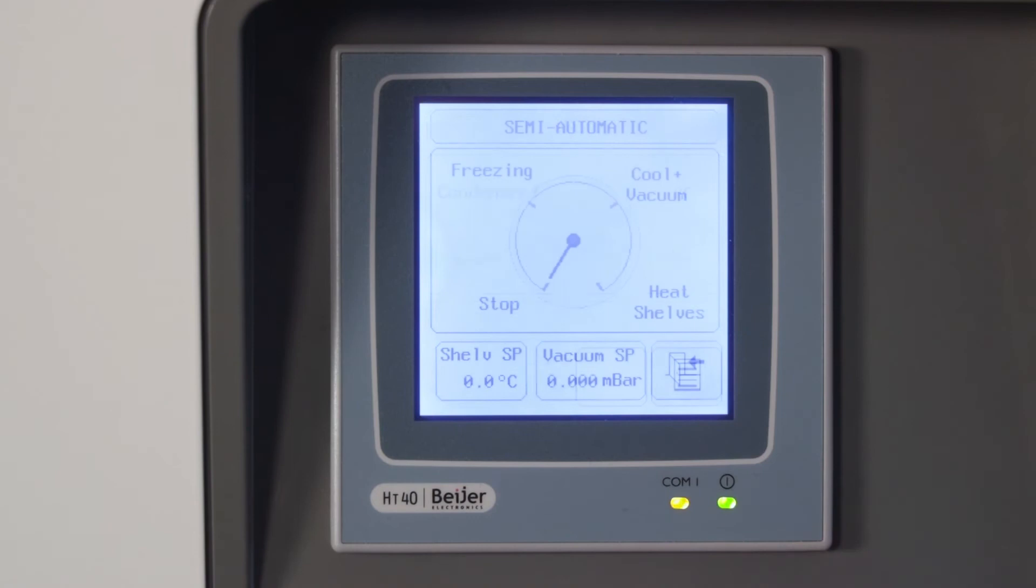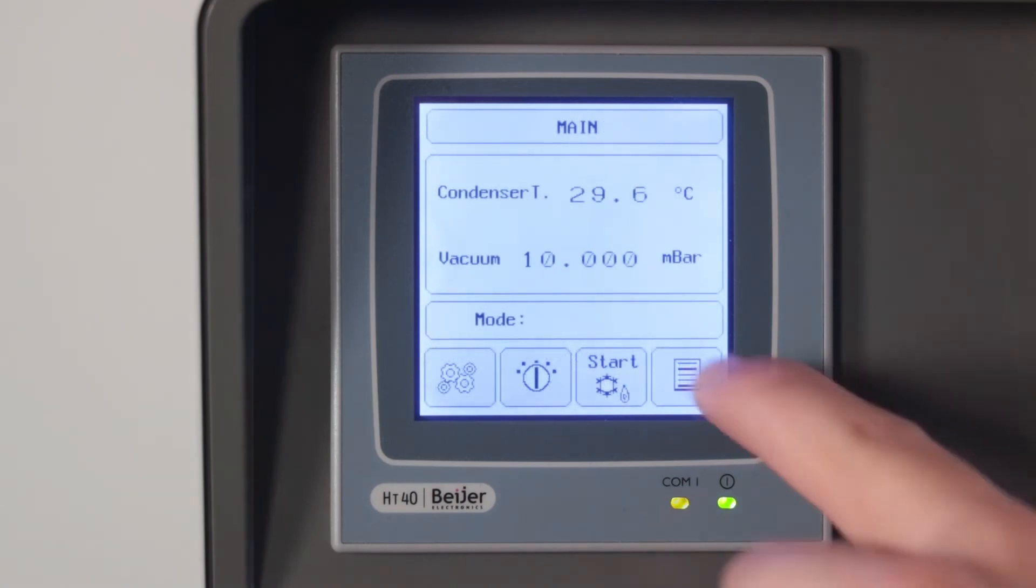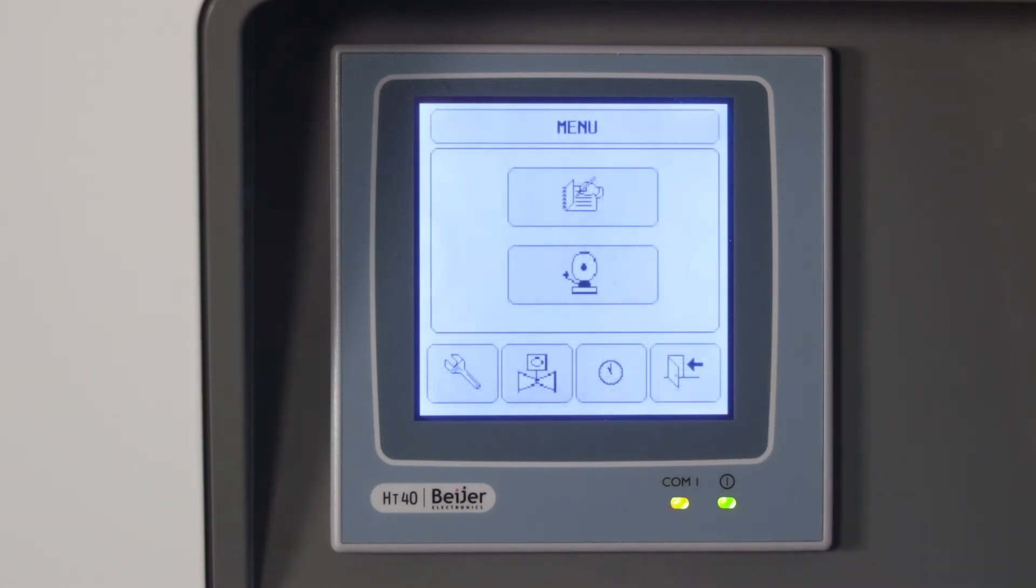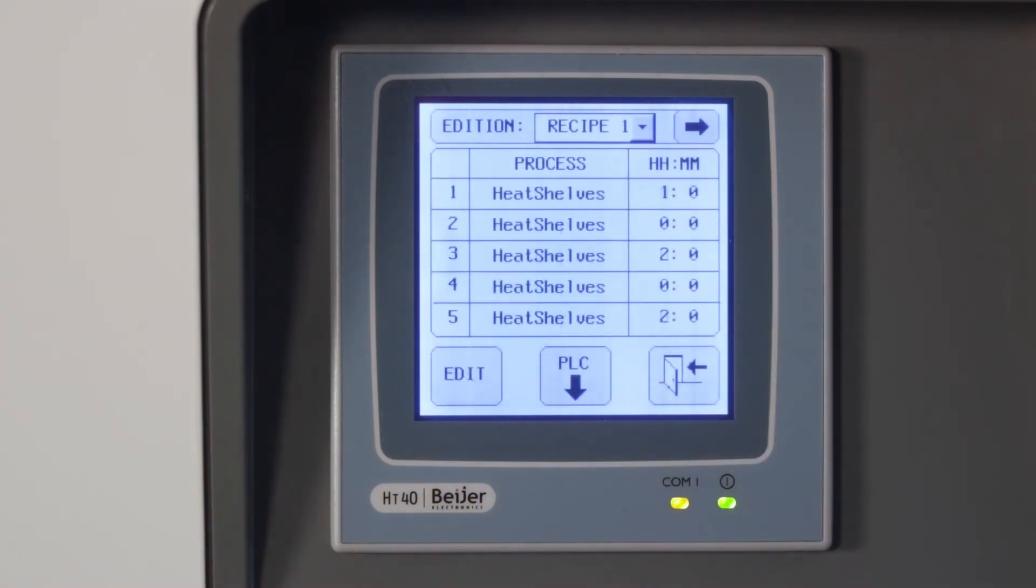The fourth button of the main screen is used to access the menu. The menu is used to program a recipe, to visualize an alarm, and to access your parameters. The first of them leads to the recipe edition screen.